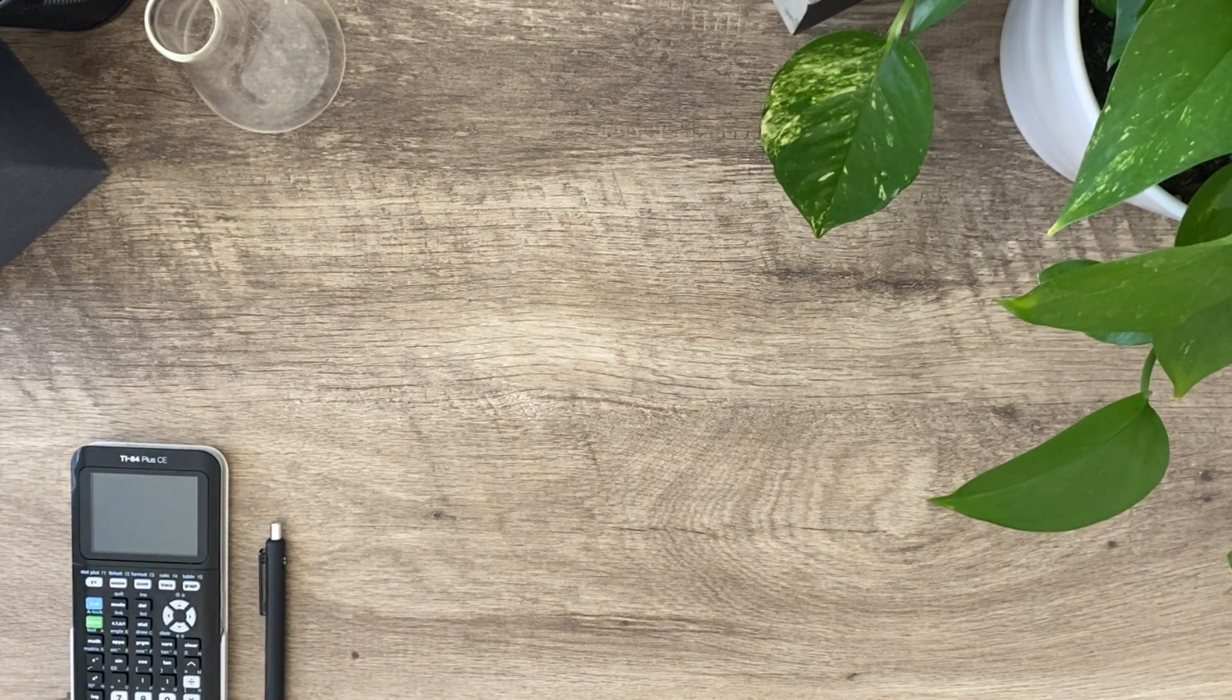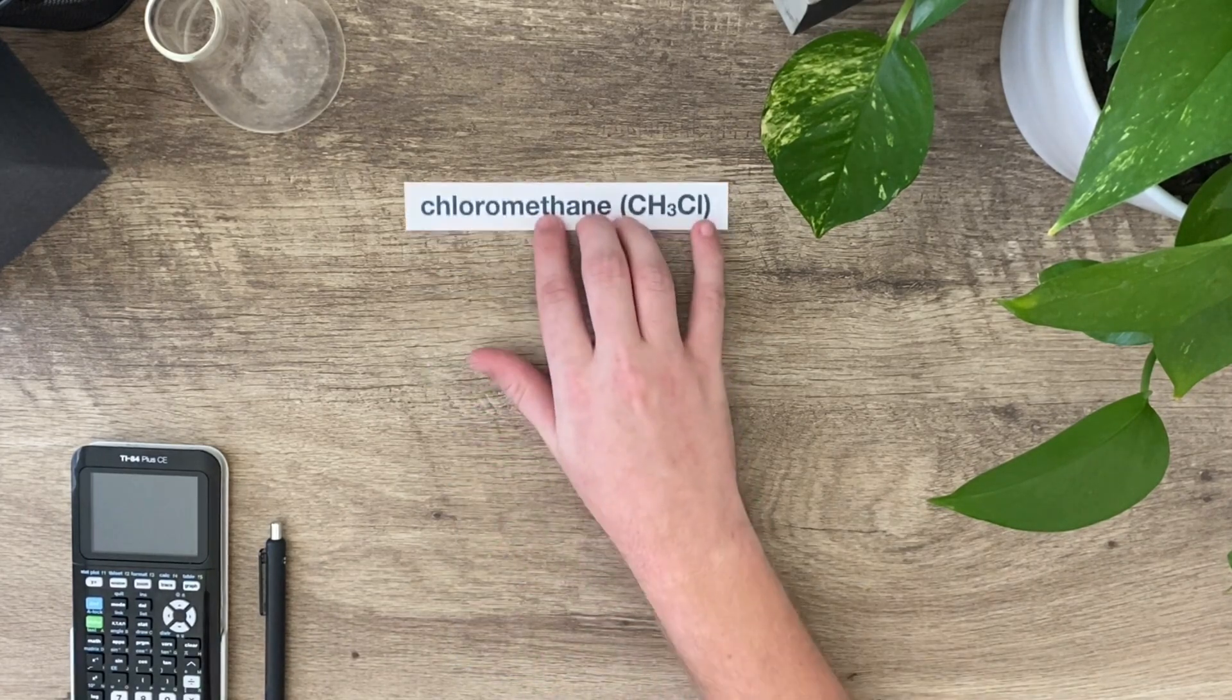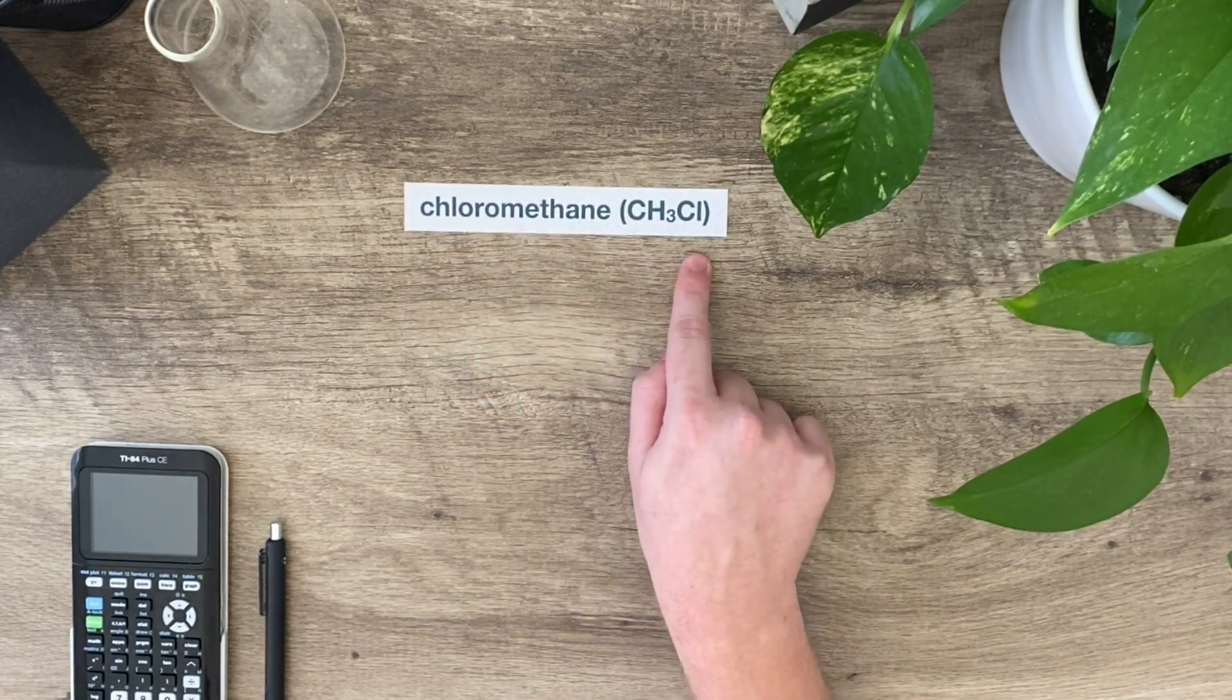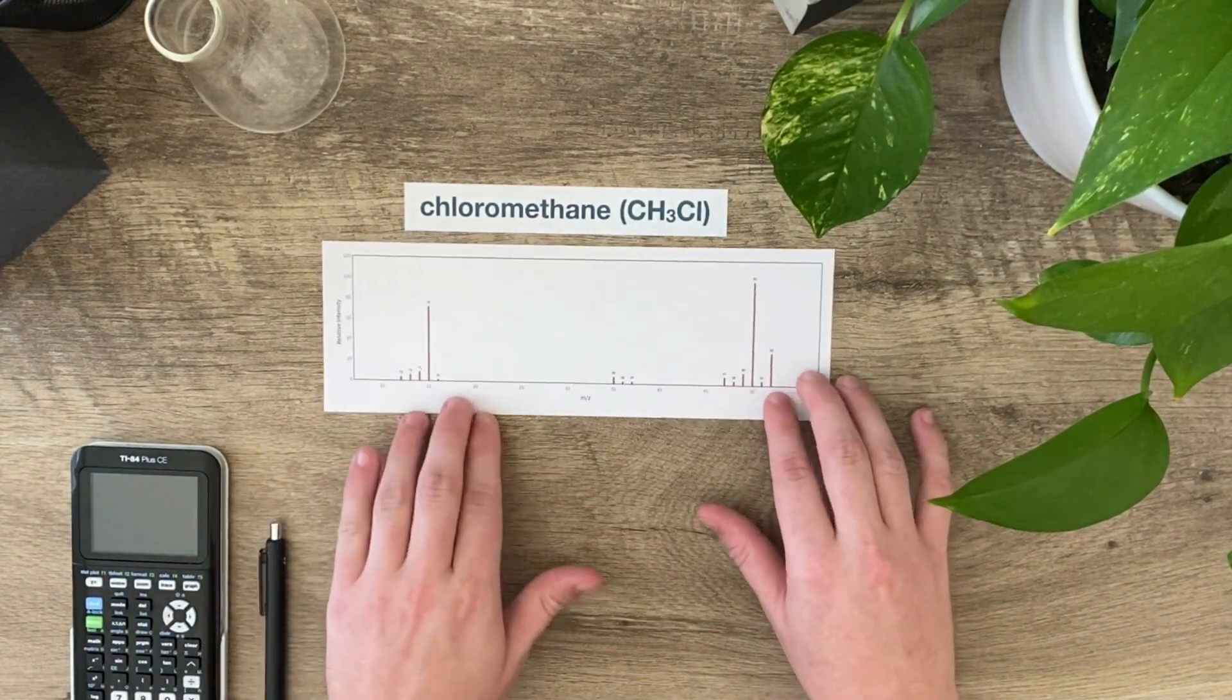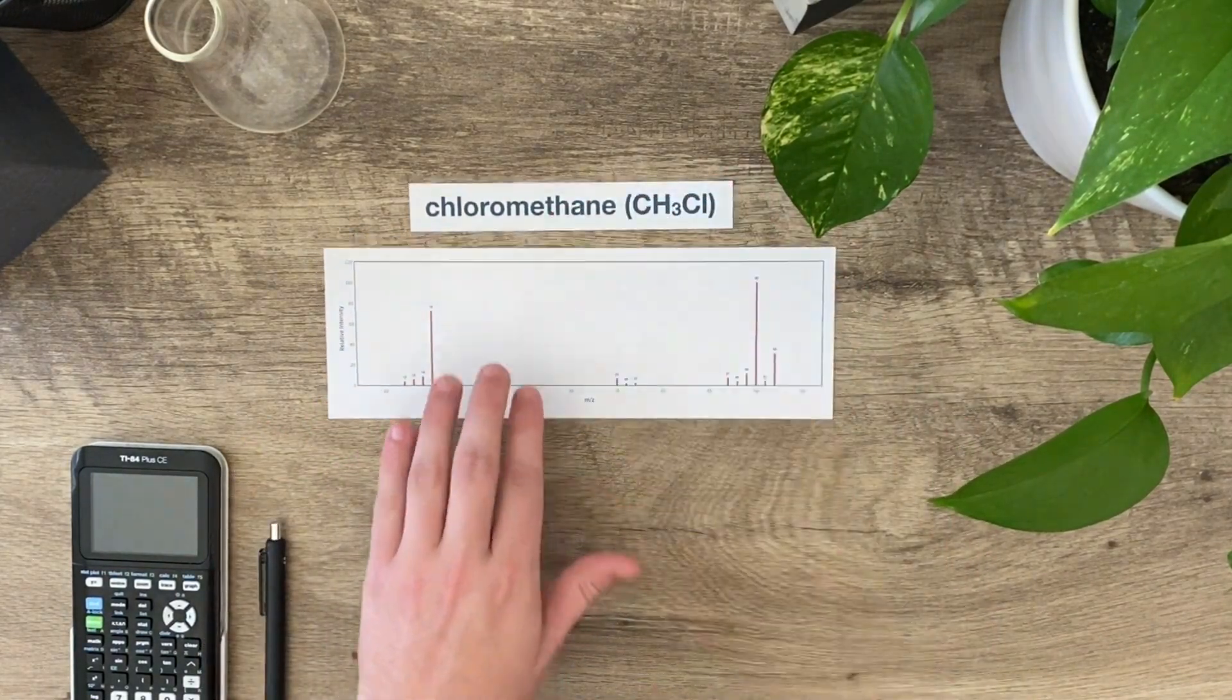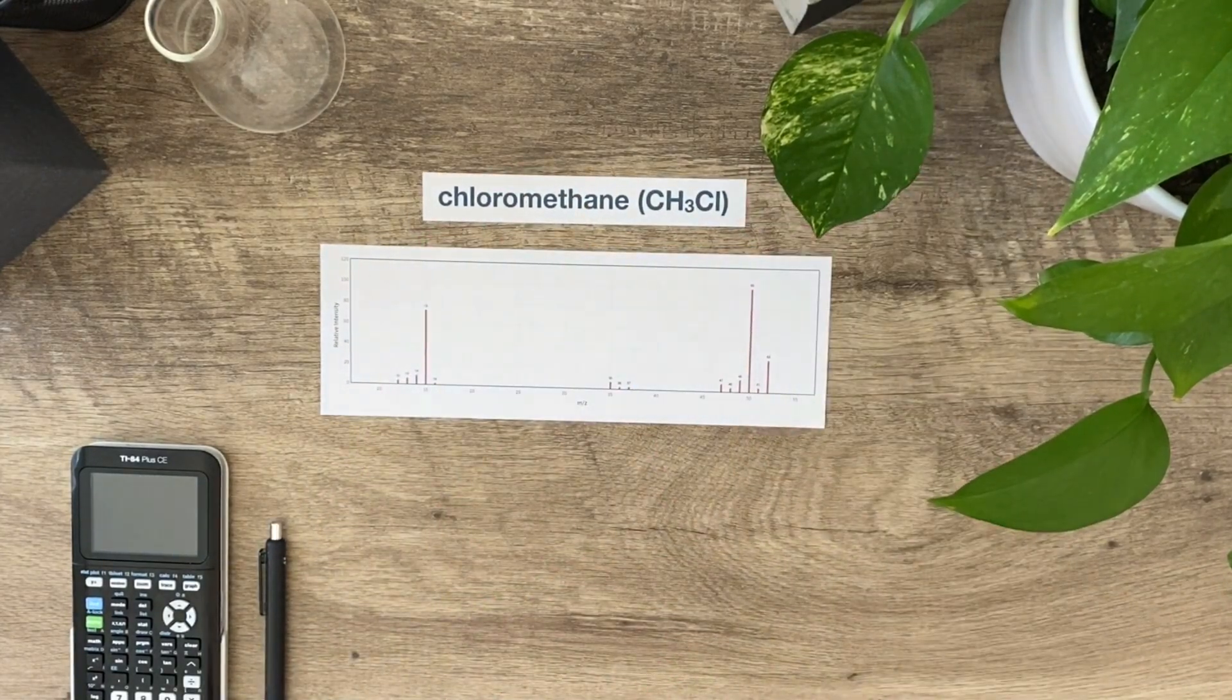Now let's take into account another example which is a molecule, a little more complicated than chlorine. Let's look at chloromethane. Chloromethane just means CH3Cl, and the mass spec looks like this. A little more complicated than the two we just looked at, I've got a lot of peaks going on, that's okay, we're only going to pay attention to a few of them.